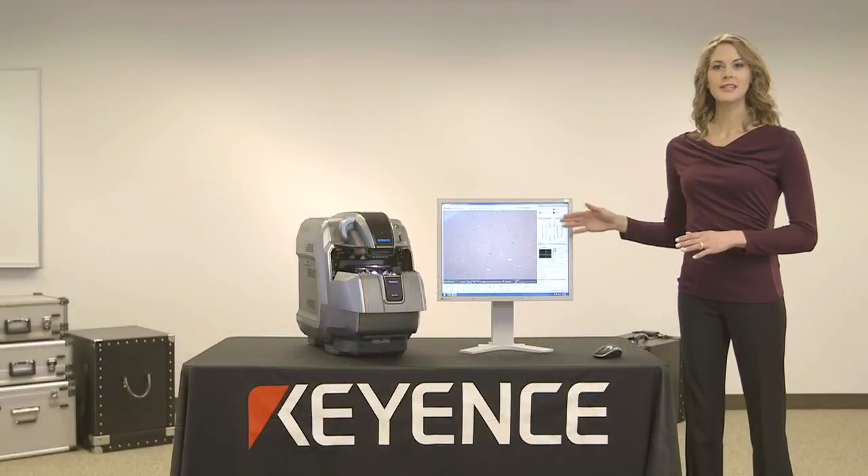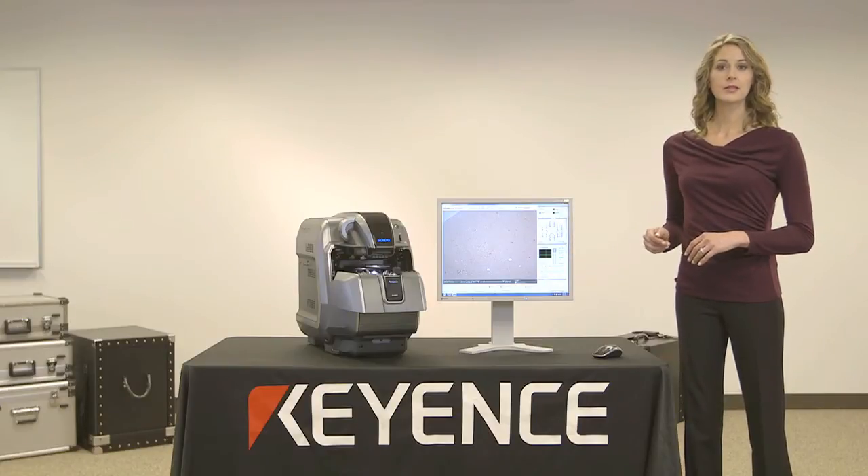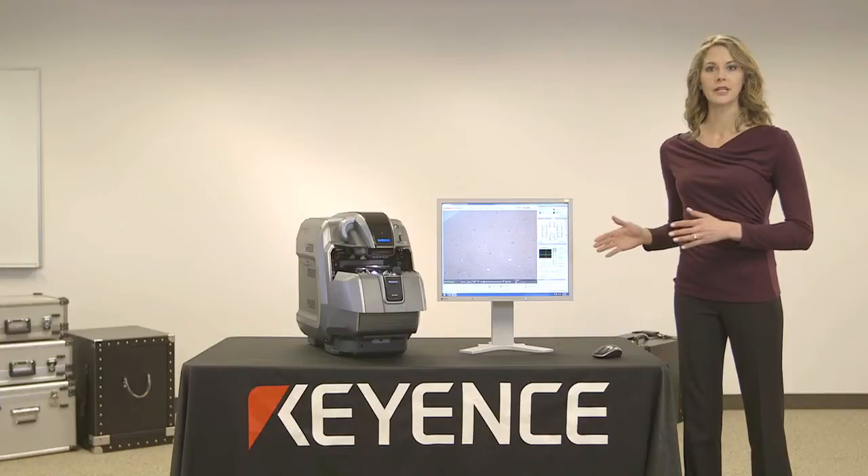What we have here is the BZ9000 All-in-One Fluorescence Microscope. The system is designed as a hybrid of several common imaging tools, with ease of use at its core.